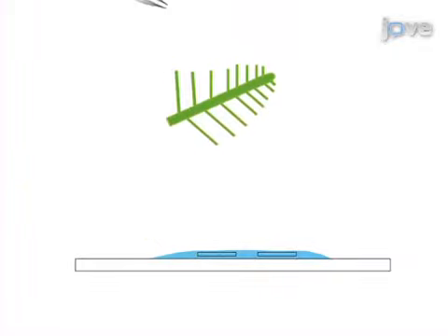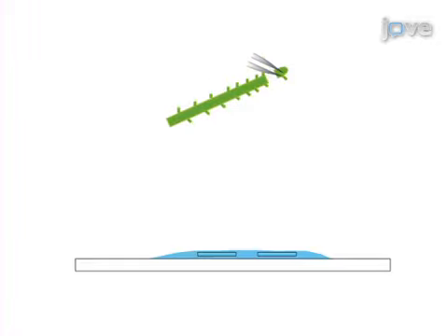The second step is to dissect and mount the sample. Remove floral buds from the stem, cut the meristem away from the stem, and immediately embed the cut meristem in the thin agarose film on the glass slide.